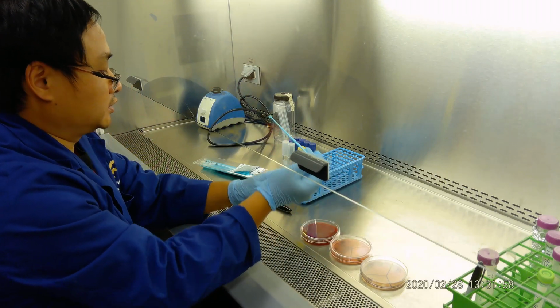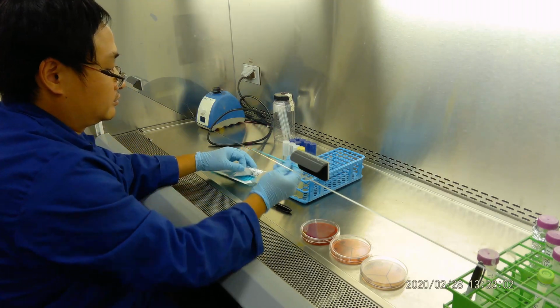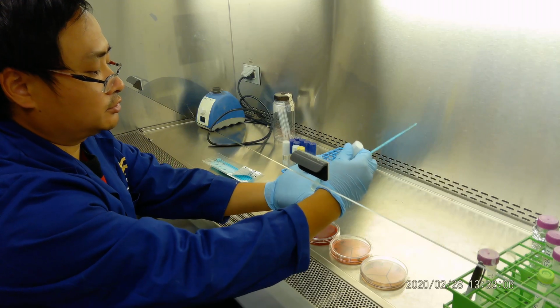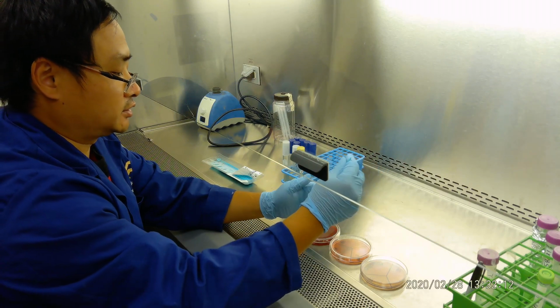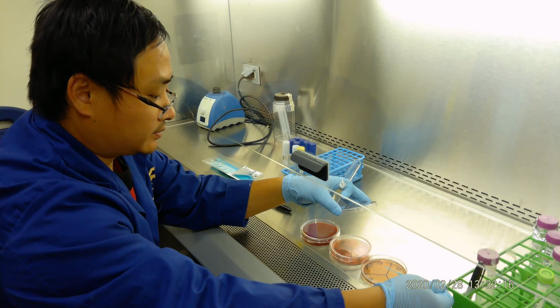And the last one we will do is Pseudomonas aeruginosa. So use a loop. You have Pseudomonas aeruginosa. Now make sure for this one you shake it a little bit. Okay, before you do, make sure you shake it a little bit. Sometimes the bacteria is at the bottom, so you get Pseudomonas aeruginosa.